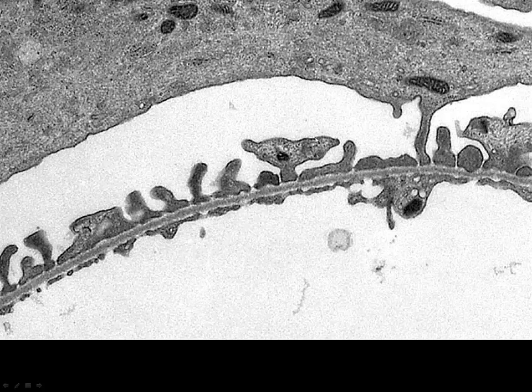And then here are the pedicels of our podocytes. Here's a podocyte process, and there's a pedicel attaching down to the basement membrane. There we can actually see a membrane slit between those pedicel slits. So you have those membranes there on the other side as well. We don't call them fenestrations on that side, though.